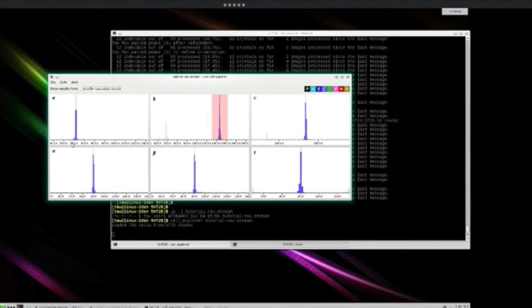It looks like it's a bit over 60 angstroms, 120 something, 170-ish there, yeah, a bit under 170, and then 90 degrees, and C center. So it looks like an orthorhombic C cell. To deselect, just Shift and then just click instead of dragging.